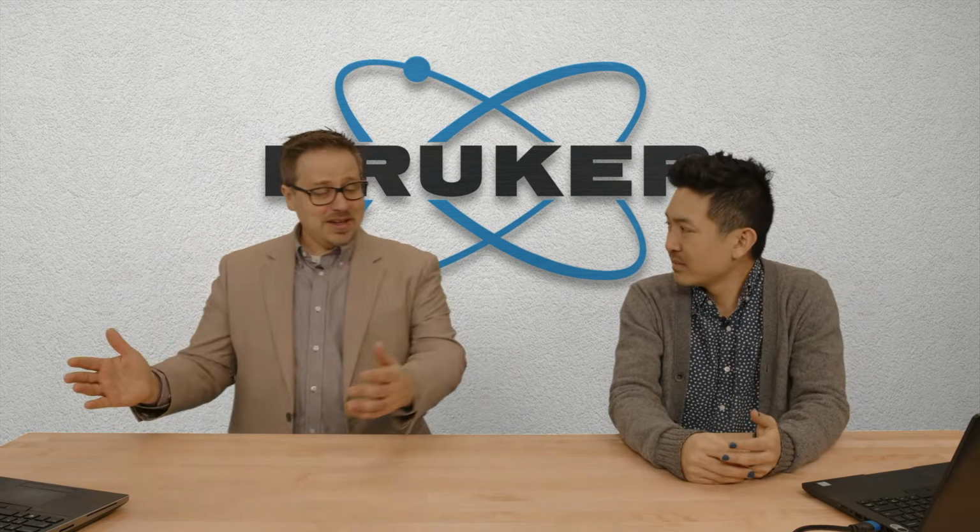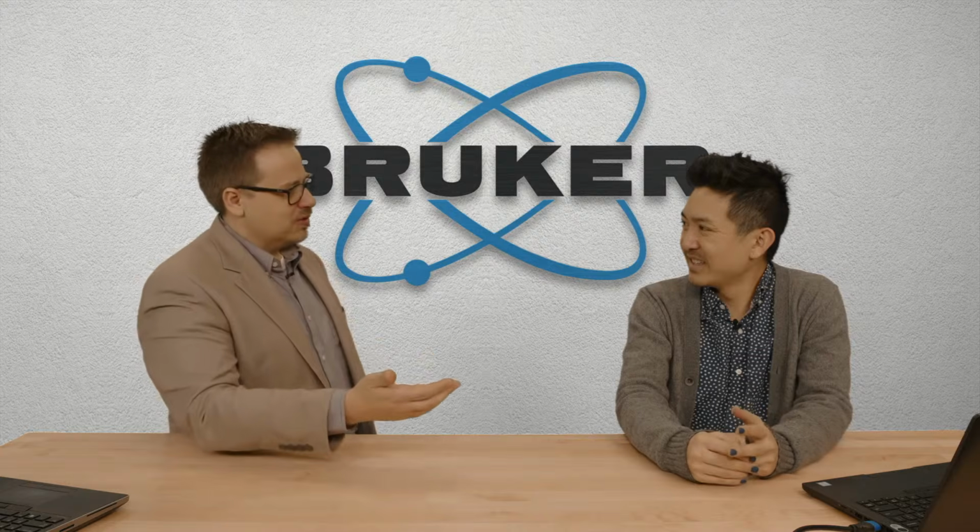Right. What brings to my mind is I remember going out to some sites with the drill guys, or drill people, I should say, and they're like, hey, you got this cool new XRD, and they're like, why do I need that? And you're like, because it will tell you exactly what's in the thing you're doing, and they're like, okay, you mean like in the rock or in that? They grab a bit of it, run it in their hand, they might smell it. Maybe even, if you get the ambitious one, they might get a little taste. And then you're like, I can tell you right now, this is 43% this, and 15% that, and 16% that.